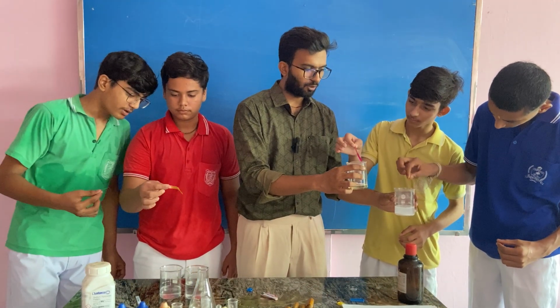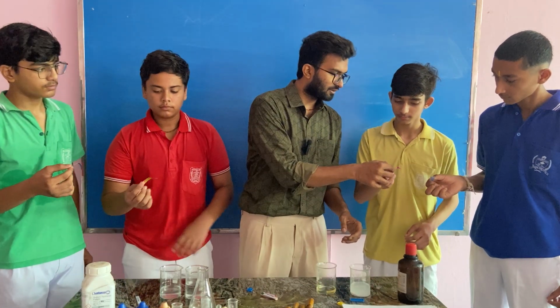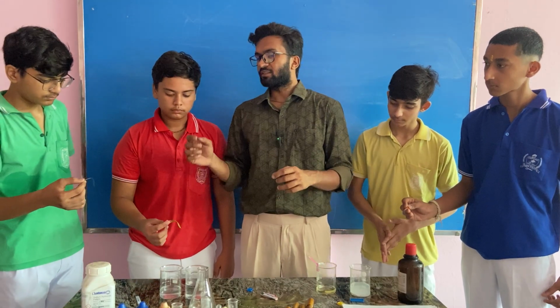Oh, let's see what has happened. देखो, देखते हैं क्या हुआ है. It is showing some flames here. Put it here. Okay, let's check the color.